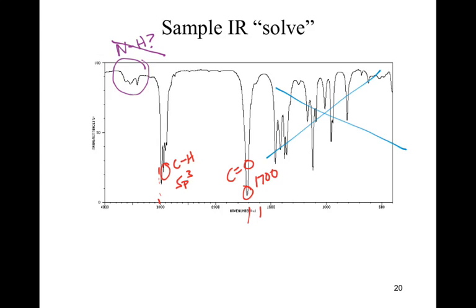The next part about it that makes it even trickier as to what it actually is, it's showing up about 3400. Half of 3400 is 1700. At 1700 we have a wicked intense peak. What we're seeing out here is something known as an overtone. It's a signal doubling.